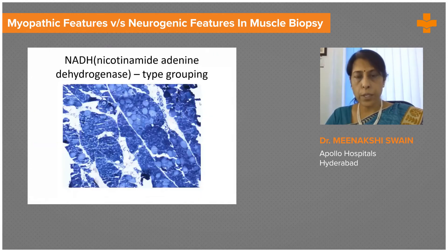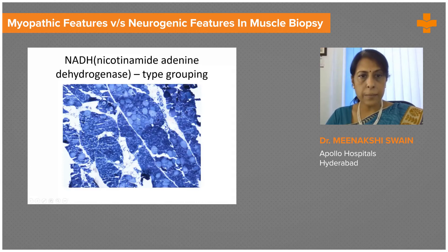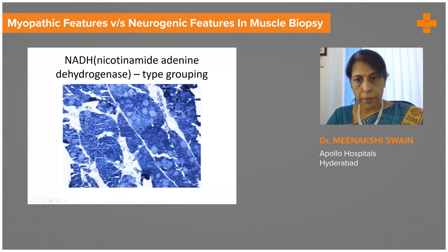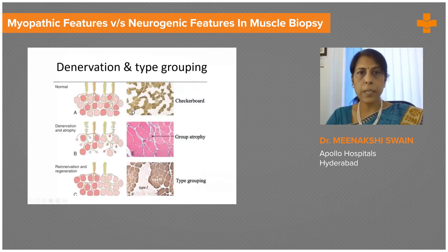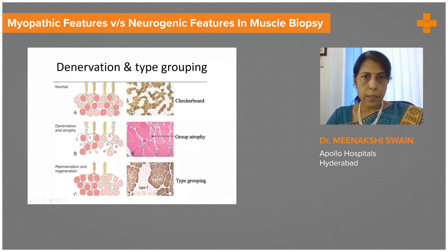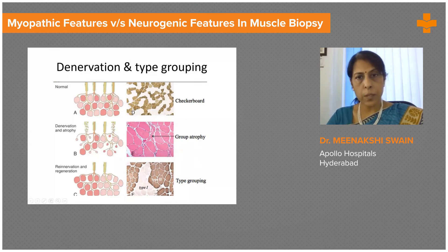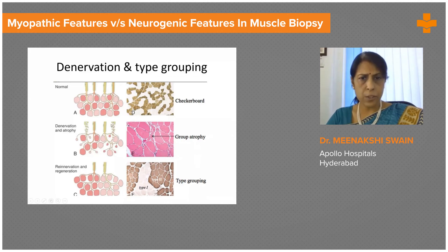Another feature of neurogenic atrophy is seen in enzyme stains. This is one of the enzyme stains we routinely use in the muscle lab — nicotinamide adenine dinucleotide dehydrogenase, or NADH stain. These stains show what is known as type grouping — groups of similar fiber types — so you see groups of dark fibers and groups of light fibers. In a normal muscle, fibers are randomly distributed giving the popular checkerboard appearance on ATPase and other enzyme stains.